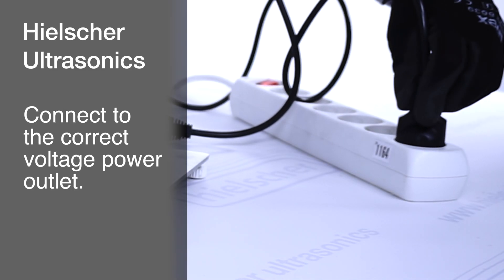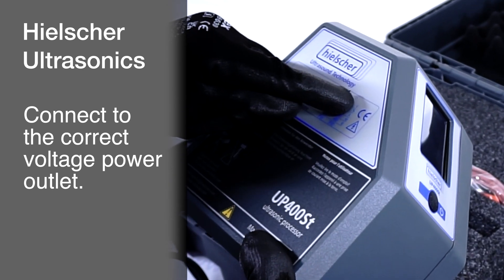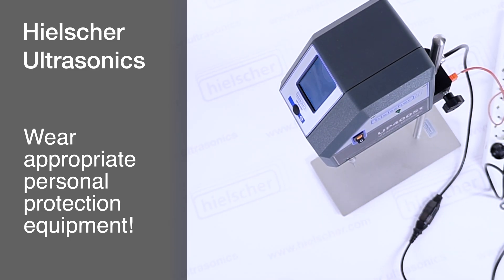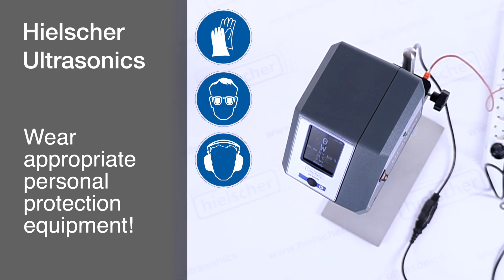Connect the device to the power source, making sure the device variant matches your network voltage to avoid damage. Before turning on the device, ensure that you wear appropriate protective gear, such as gloves, safety glasses, a lab coat, and hearing protection, depending on the material to be sonicated.